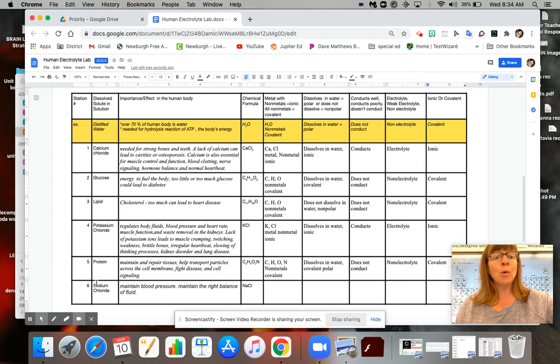Okay, last one, sodium chloride. We know sodium's important in our diet. It helps with blood pressure, right? Too much sodium is bad. Too little is bad as well. And we're not really talking about sodium metal, sodium chloride, salt. Okay, so let's go over here.